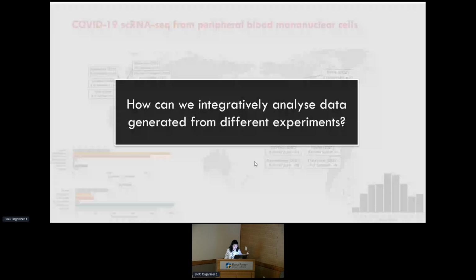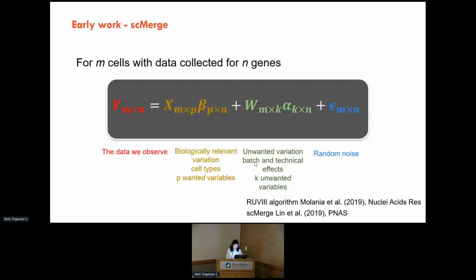within each study, batches across the donors and individuals. Secondly, the biological variation is also multi-layered. We will have information associated with the samples, for example, the developmental time or treatment, and we will also have information related to the cells. And lastly is the scalability of the algorithm.